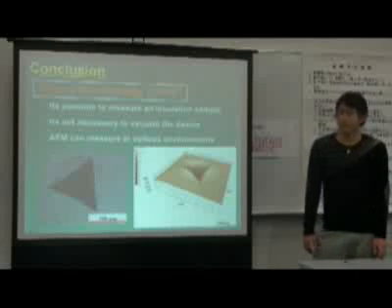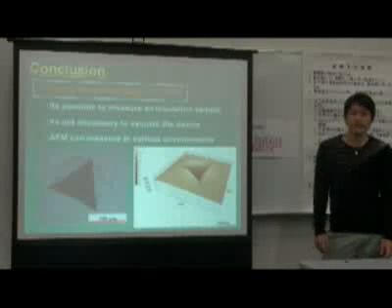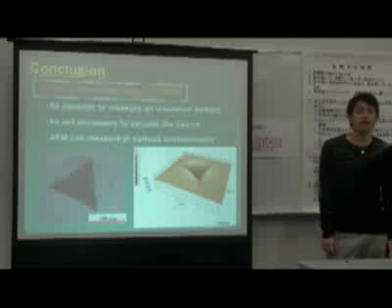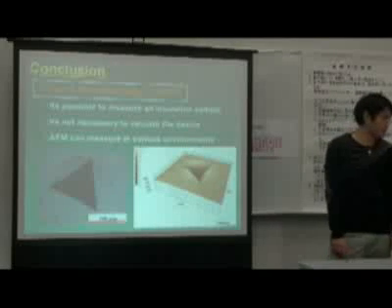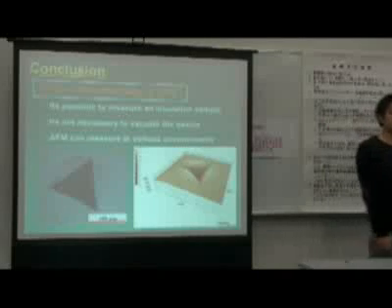As I explained, AFM is easy to operate and it can measure in detail. So in the future, AFM will be used more. This is the conclusion of my presentation.